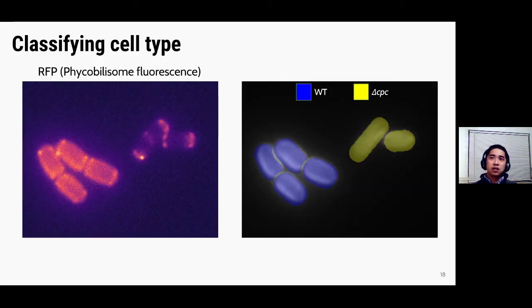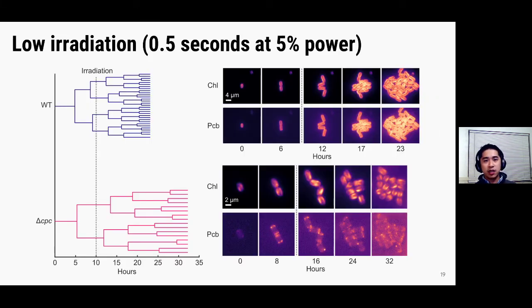So to analyze the cells, I wrote some code to identify the wild-type and delta CPC cells based on the phycobilisome fluorescence. And once we do that, I can basically bin the data into two different groups. And these are two representative plots of two different colonies that we can see. So this top plot here shows a lineage tree for a wild-type colony, and you can see that this dotted line here indicates the irradiation event. And you can see that the cells continue to grow, and they don't seem to be perturbed by the irradiation at all, they just continue to divide. And the same thing happens here for the delta CPC cells as well.